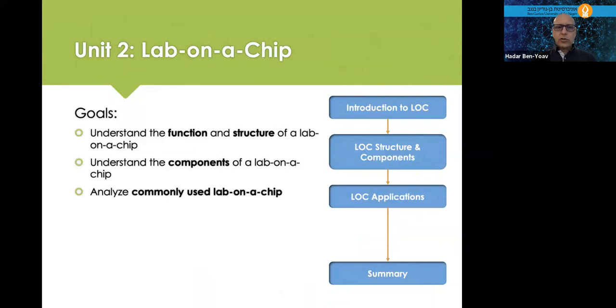So the goal of this second lecture is to understand the function and the structure of Lab on a Chip. What are the components a Lab on a Chip is built of? What is the function of each one of the components? And we will also analyze some commonly used Lab on a Chip devices, some examples from literature.